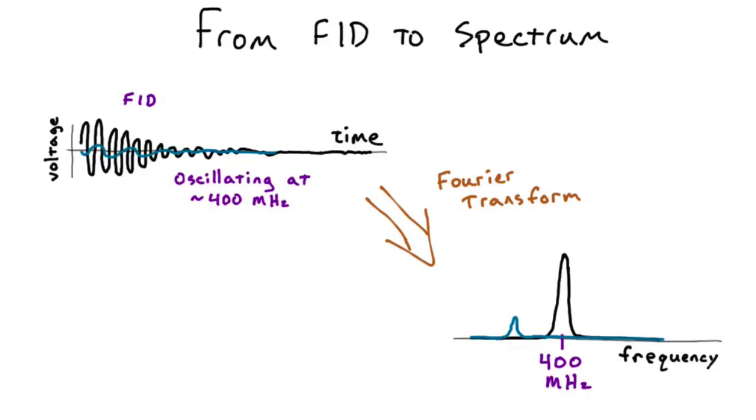And the wealth of information that we have from an NMR spectrum is part of the power of this method, that we can get all kinds of useful information about our compounds from NMR, and it's a wonderful thing to do. So hopefully this video was helpful in giving you the basics of NMR, and happy sciencing, everyone.